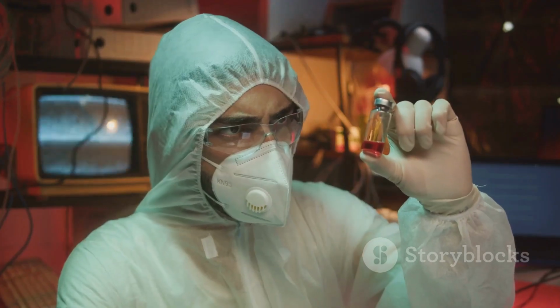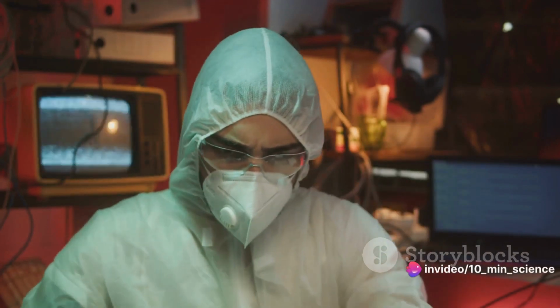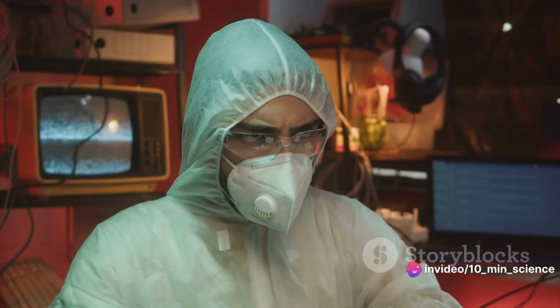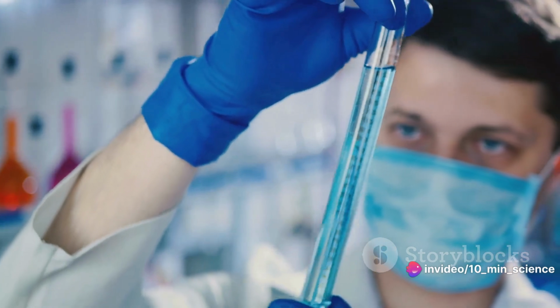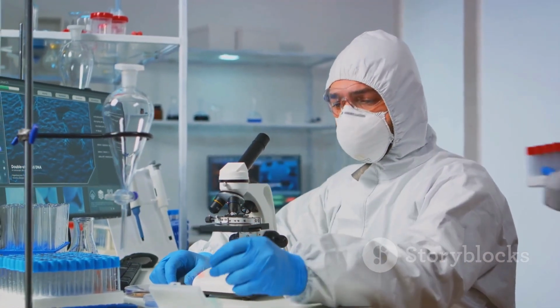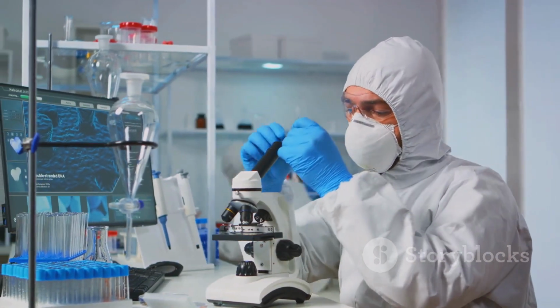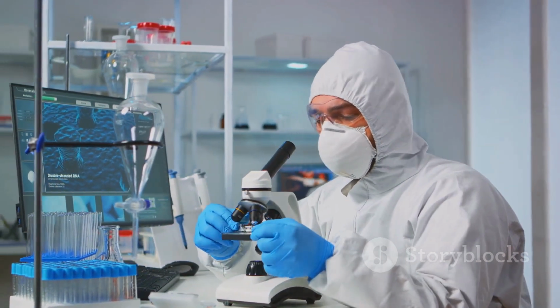It's the bulwark that ensures the alginates used in our medicines are of the highest standard. So, as we conclude, let's remember the importance of these procedures, their role in maintaining the integrity of our medicines, and the meticulous work that goes into each assay. Remember, USP chapter <311> Alginates Assay isn't just a procedure, it's a crucial safeguard in the world of pharmaceuticals.